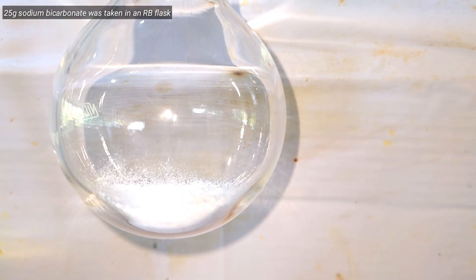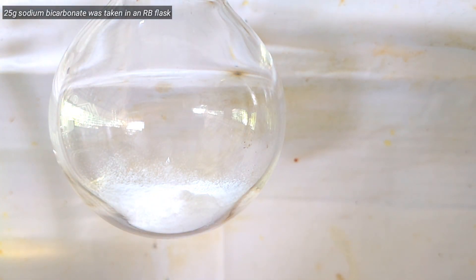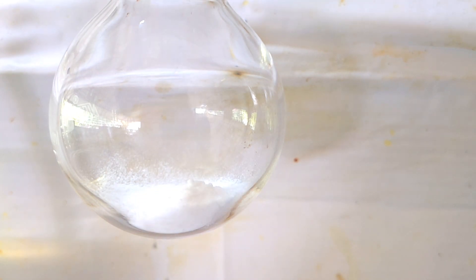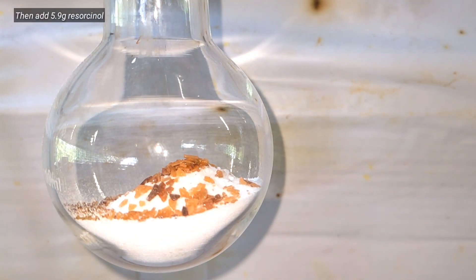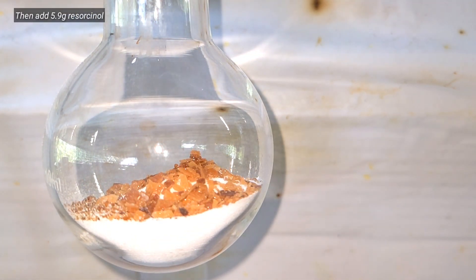Start by fixing a small 100 milliliter round bottom flask on its stand and start adding the sodium bicarbonate, or sodium hydrogen carbonate otherwise called baking soda, into it. On top of that was added 5.9 grams of resorcinol.